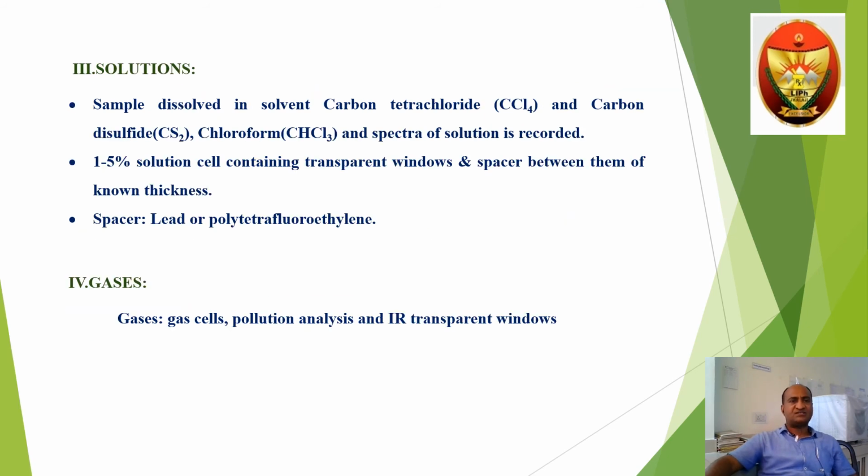For the analysis of solutions, we have to dissolve our samples in carbon tetrachloride, that is CCl4, or carbon disulfide, CS2, or chloroform, that is CHCl3, and the spectrum of the solution is recorded.